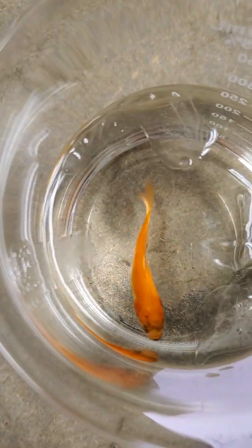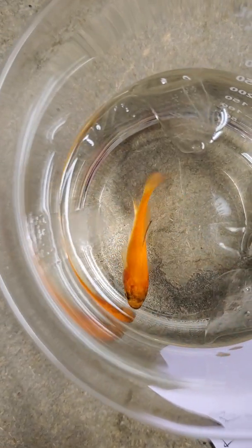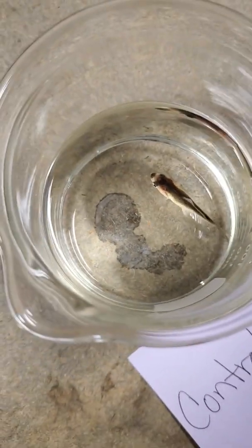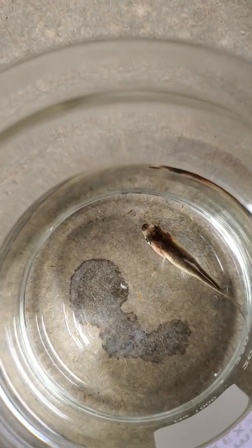I apologize if it's hard to see his gills coming in and out or his mouth opening and closing, but I think you guys will do just fine. You'll do great. Do your best. Let me know if you have any issues with it. And stop. And we are going to go to our control goldfish where it's at 18.2 degrees Celsius. And start.